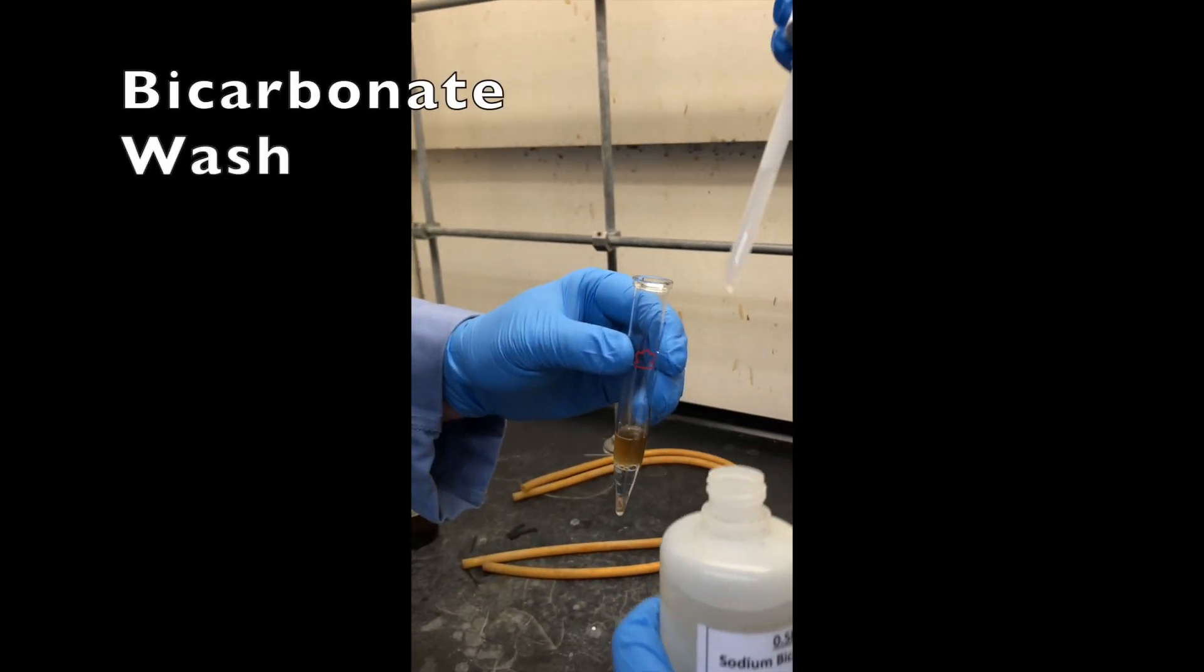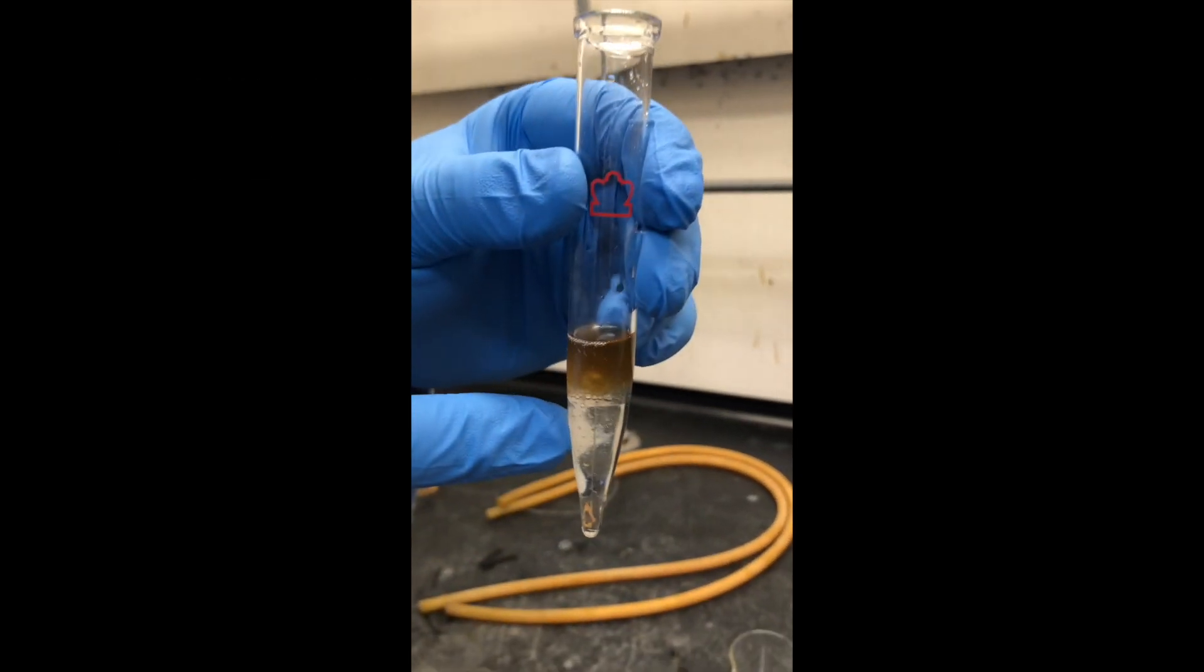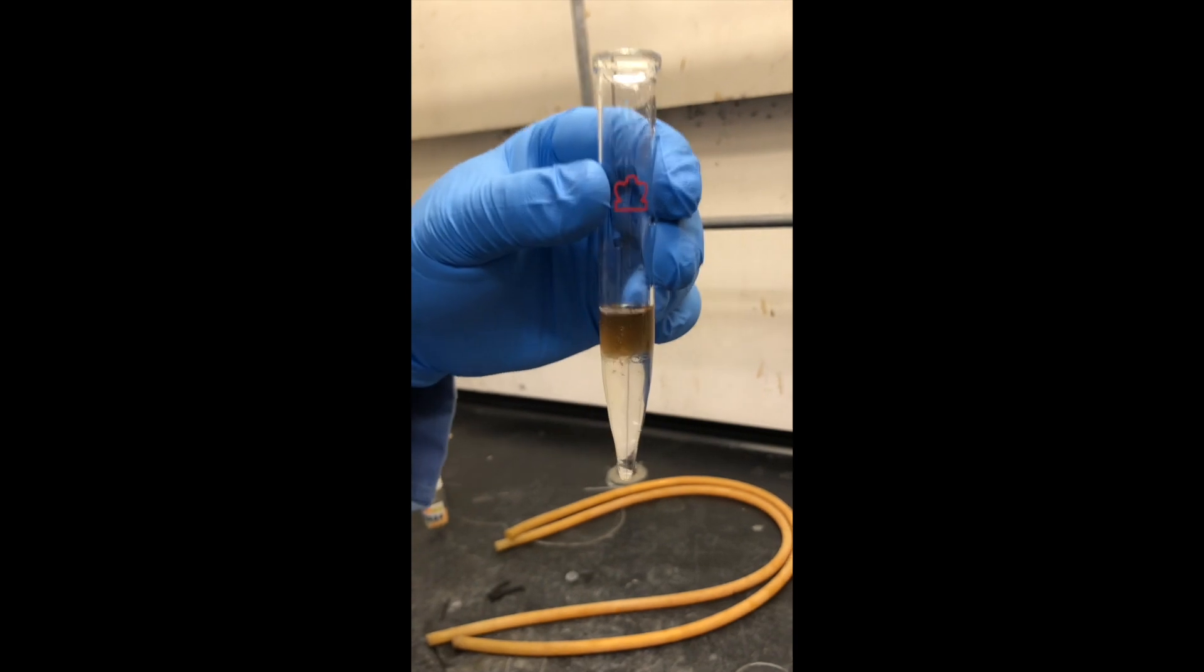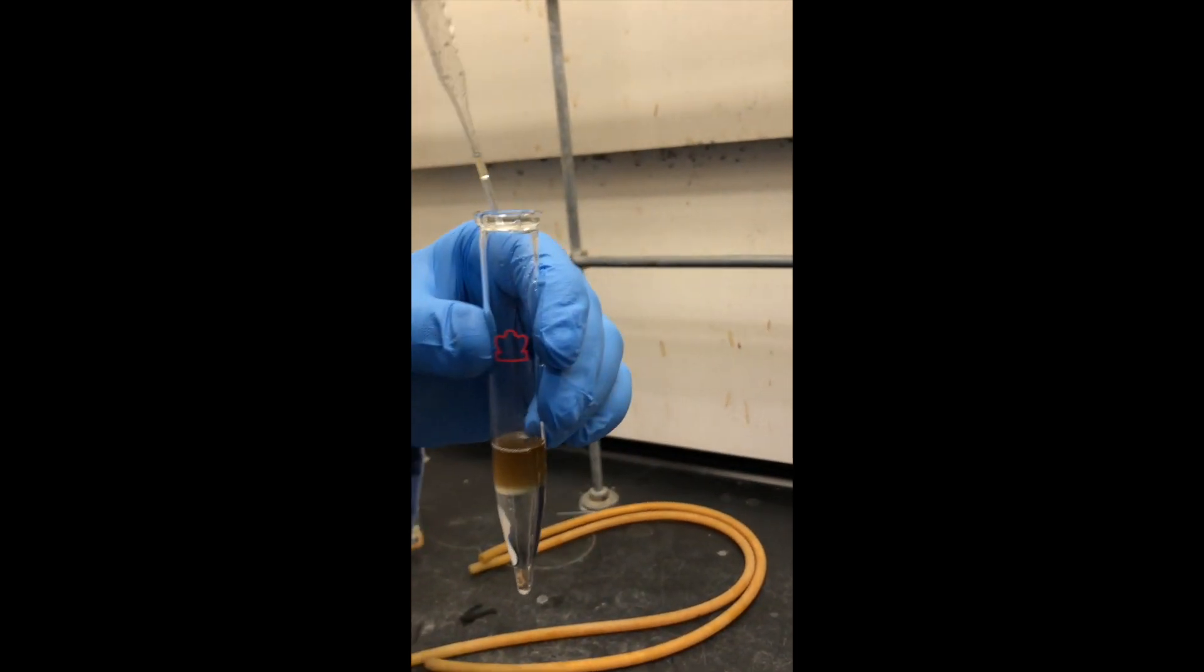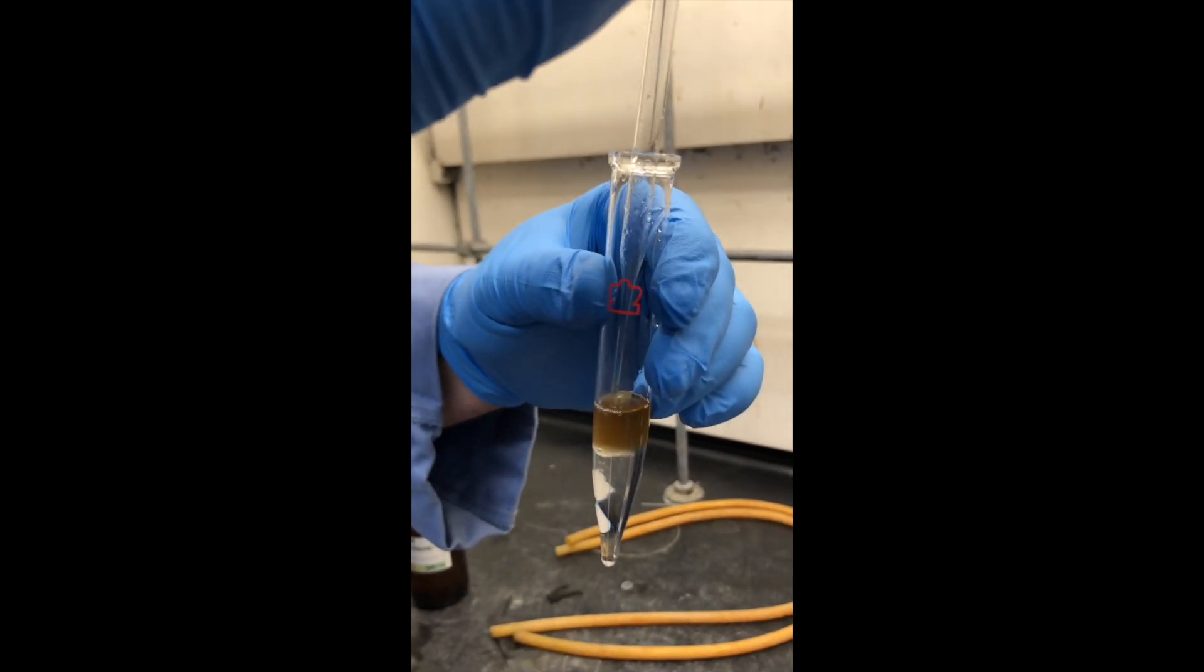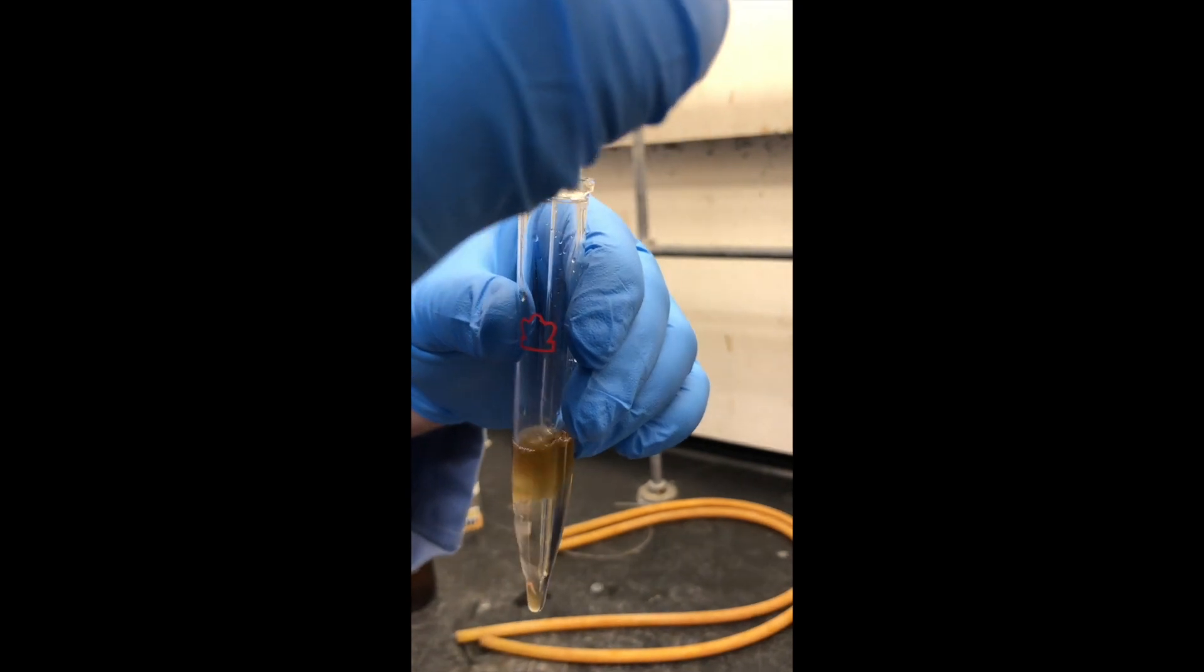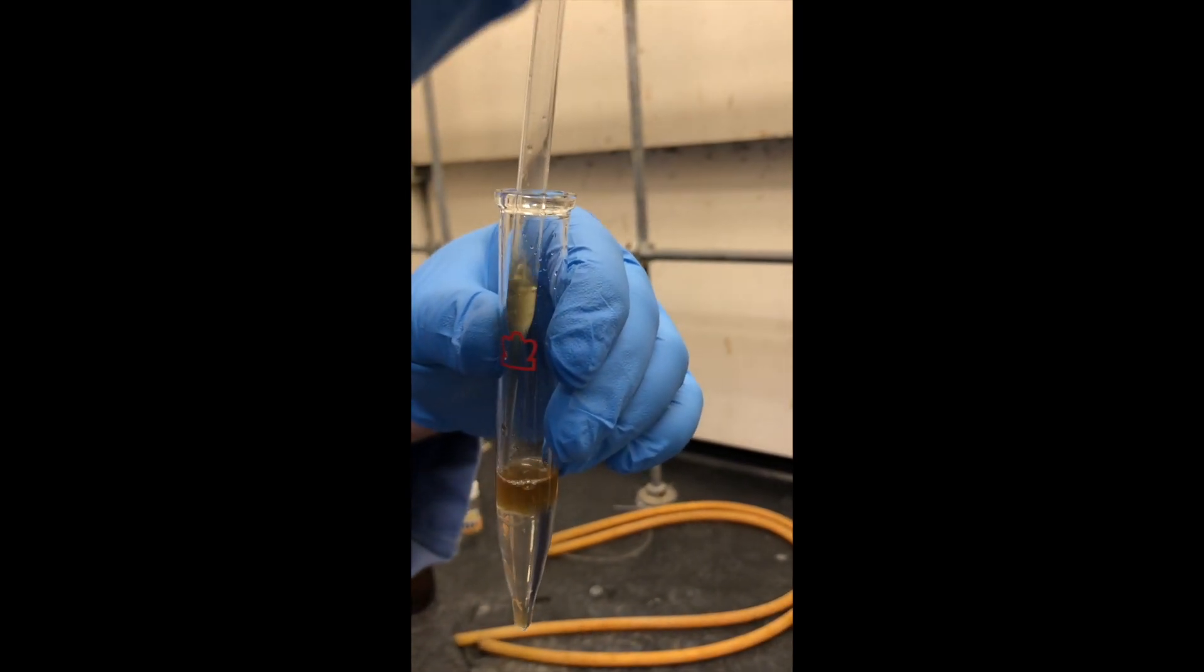So now we're adding the bicarbonate to the reaction mixture and notice that there is a little bit of fizzing. And then to mix, because we're not going to put our thumb over it and shake, we're going to basically draw up one layer and expel it into the other layer so that they can thoroughly mix.